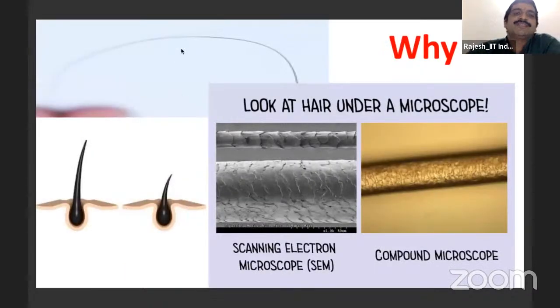See, you remember this at the top left of this is a human hair, which is the normal optical photograph, or this is something what we see through our eyes. The bottom left image, this is how this hair oil and all these shampoo advertisements show this. But this is not how the hair looks, and this is not how the hair actually are. Okay, they look very smooth and cartoon kind of thing. I'm sure you all remember this kind of thing in the advertisements.